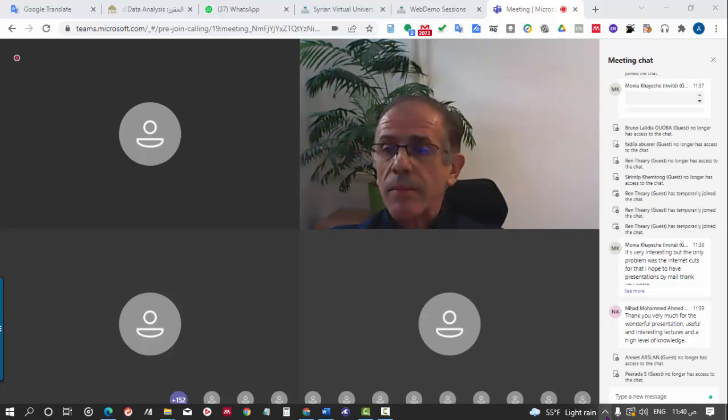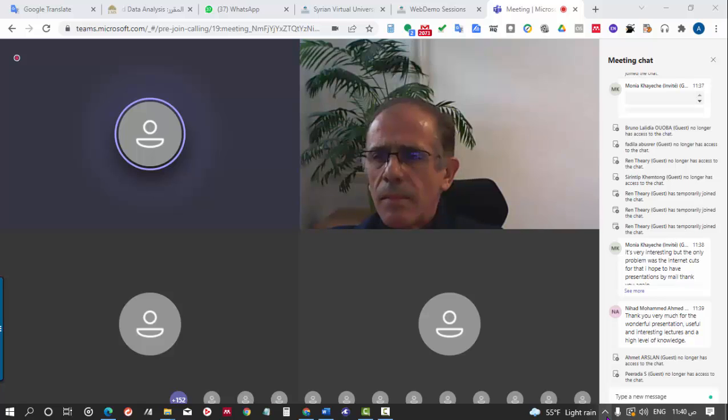Okay, thank you. A question from our colleague Shima Al-Faki. If we participate in a PT before we calibrate the equipment we use in the assay, and we gain a good result, is it not accepted for accreditation?